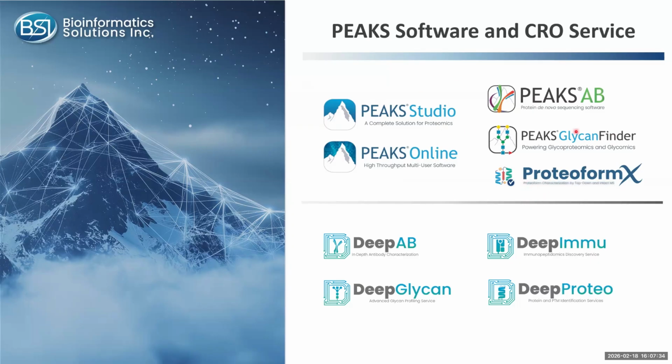Now, although we have a lot of software services, we also do have a very comprehensive lab service for antibody sequencing, immunopeptidomics, glycoproteomics, as well as just general proteomics too. However, for this presentation, I will be mainly focusing on Peaks Online, which is our solution for high throughput multi-user software.